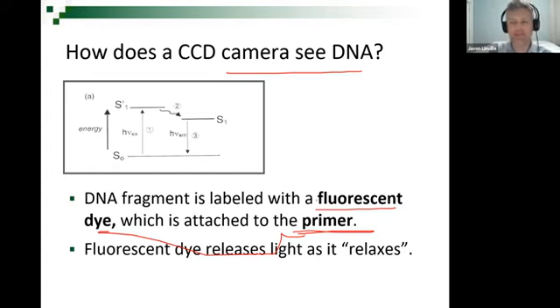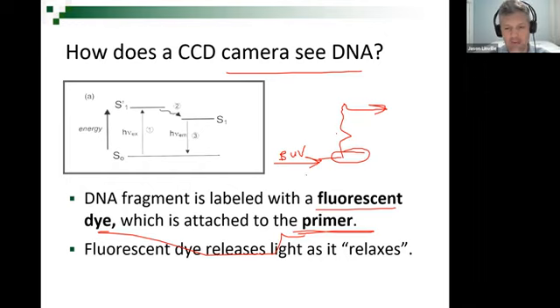Well, this is the same concept that we already covered when we talked about visualizing semen stains. We put high energy, low wavelength blue or ultraviolet light right onto the fluorescent stain. The fluorescent stain had molecules that would absorb that light, get excited, and then emit light at a higher wavelength. I actually drew this kind of dumb, because this is high energy down here, and then this is emitting lower energy up here in the yellow or orange or whatever color goggle range it is.